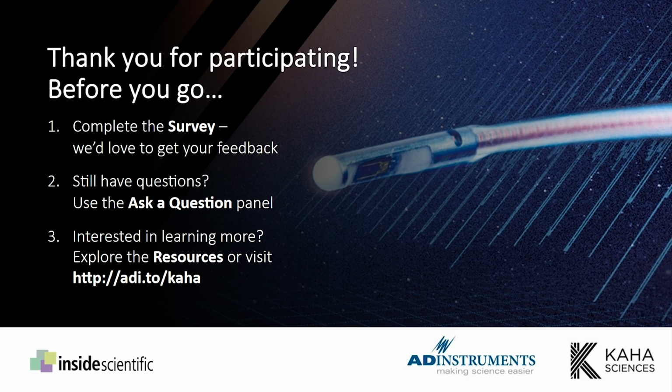Okay. Great. And then this next question is kind of related. Is there a plan to scale up the mouse system to record multiple biopotentials and/or the core temperature? I don't know the answer to that at the moment, unfortunately. It's certainly a question that people have asked me previously about recording a couple of biopotentials from the mouse system. At the moment, I don't think there are plans to do that, but something might happen in the future, perhaps.